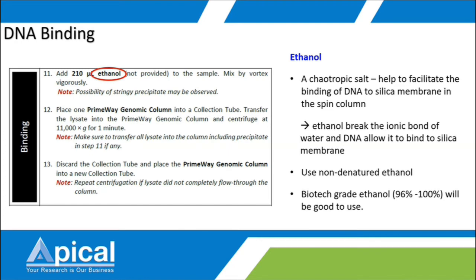And additionally, ethanol is actually a dangerous good. It is categorized as a DG item, so you will find that most of the commercial kits won't include it. You need to order it separately.